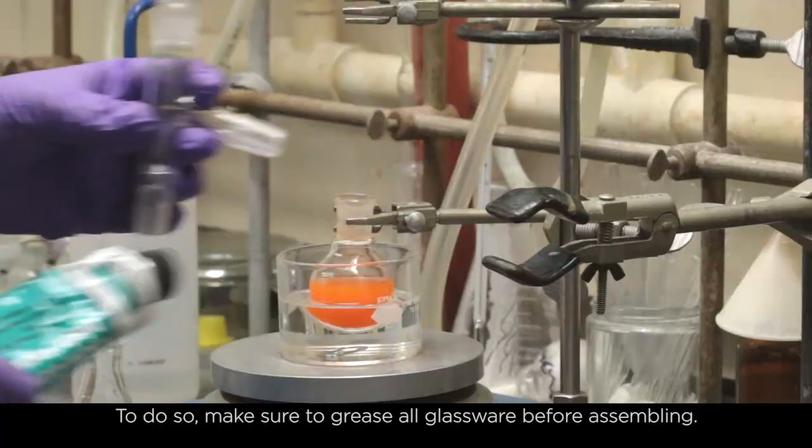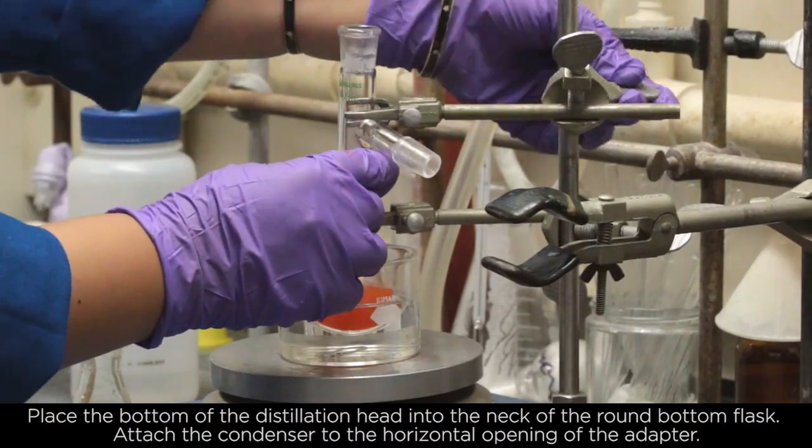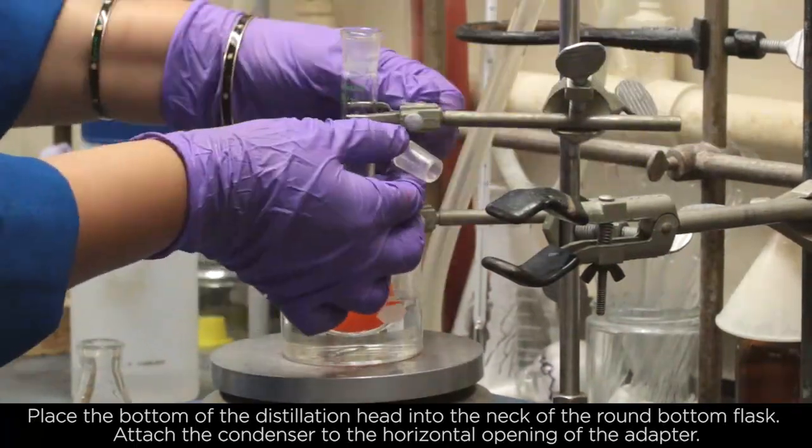To do so, make sure to grease all glassware before assembling. Place the bottom of the distillation head into the neck of the round bottom flask.